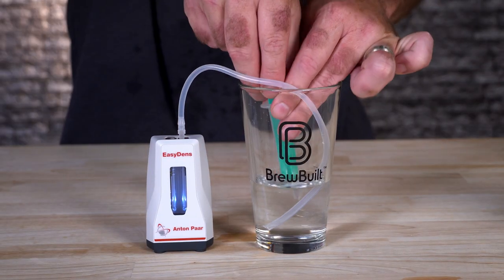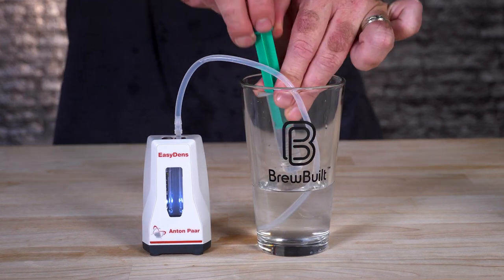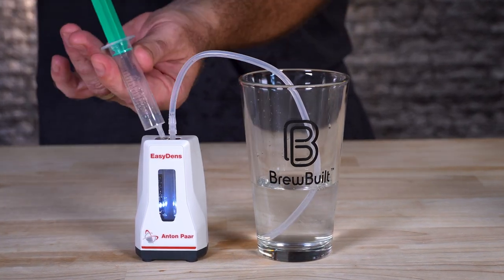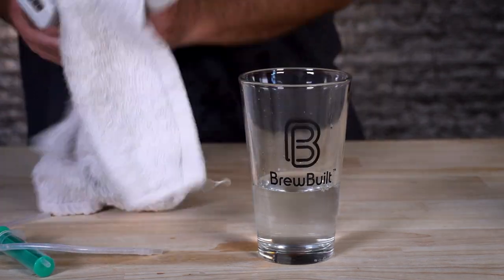Next, let's talk about maintenance. Cleaning it is super easy — just take a little hot tap water and run it through there using the same syringe and tube that you used to take the measurement. I also like to push air through there to move any remaining liquid out. Then you could put it upside down or just let it dry out. Keep your tools nice and clean and they're going to last you forever.